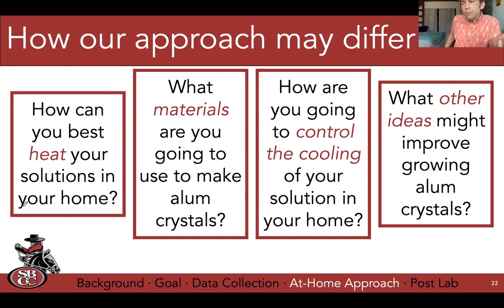Yeah, it really depends. The first day you shouldn't expect anything more than a small crystal, so yeah, those will work great. That'll be fine, and you'll be able to use that for a while. Or if you're growing a large crystal, baby food jars. I'm a big fan of recycling and reusing materials. So think about recycling containers in your area that might have those jars, even if you don't have babies at home that eat baby food.